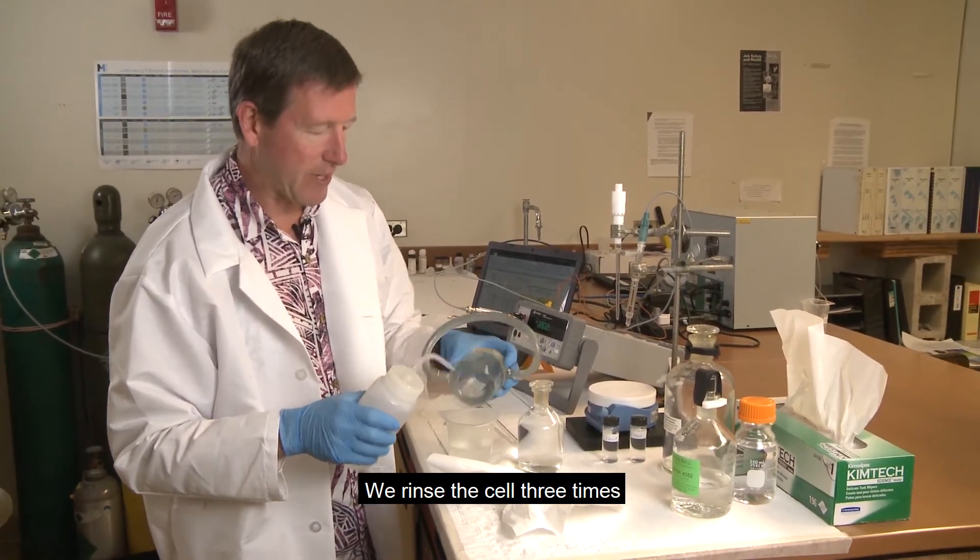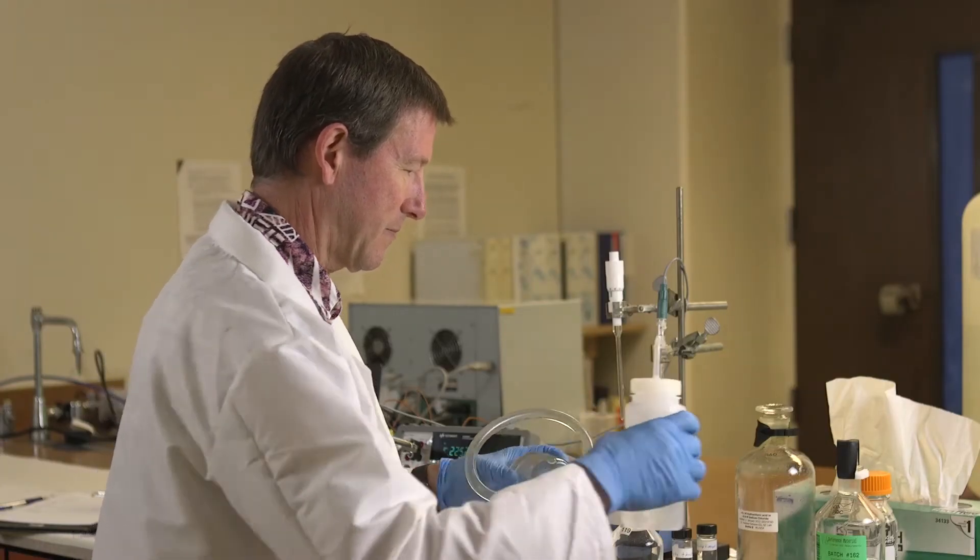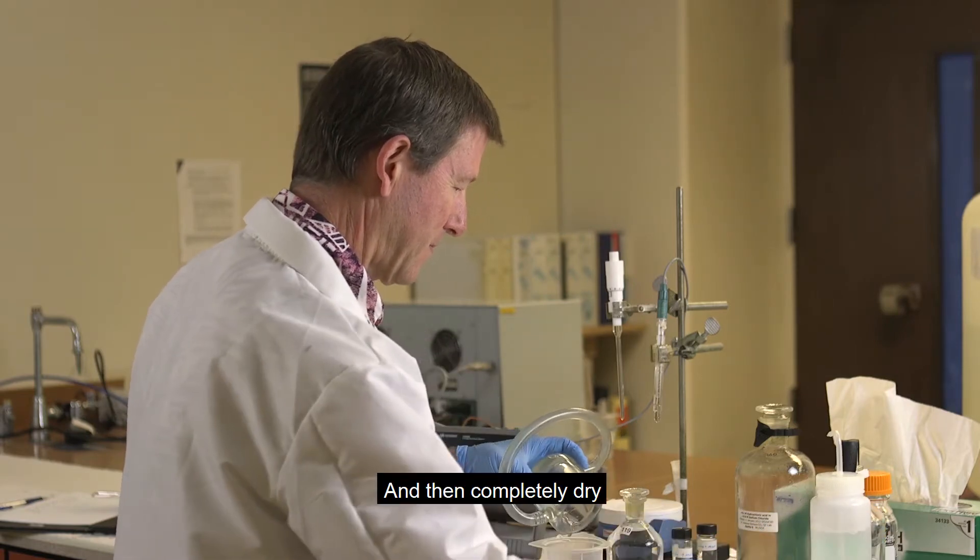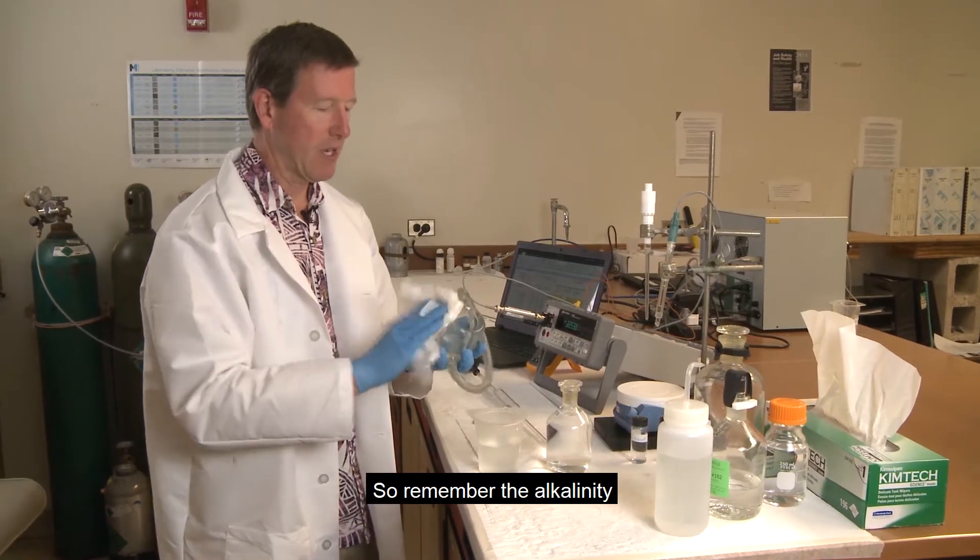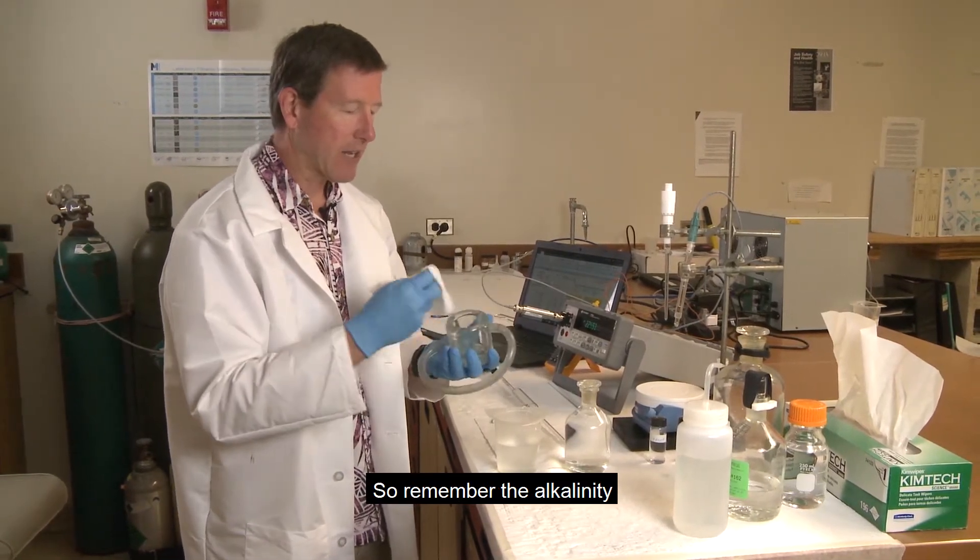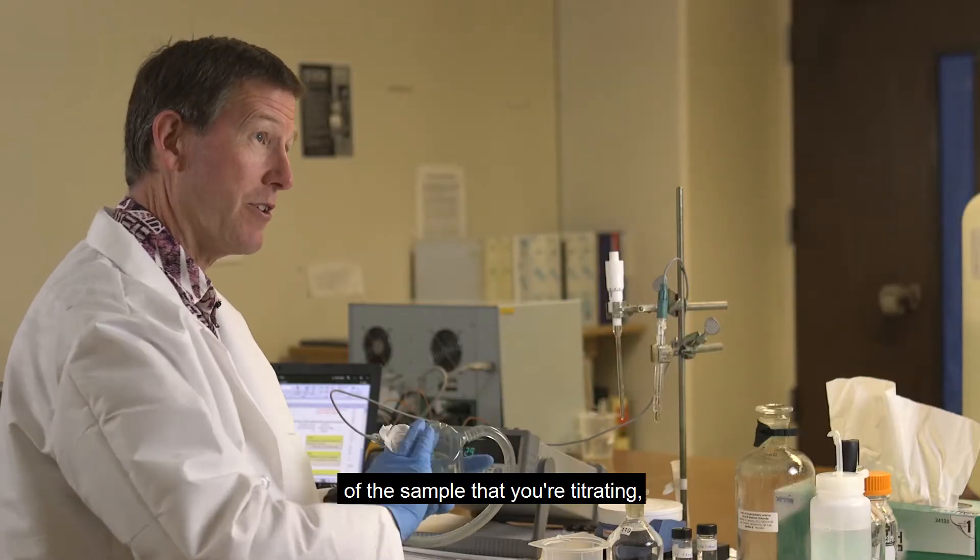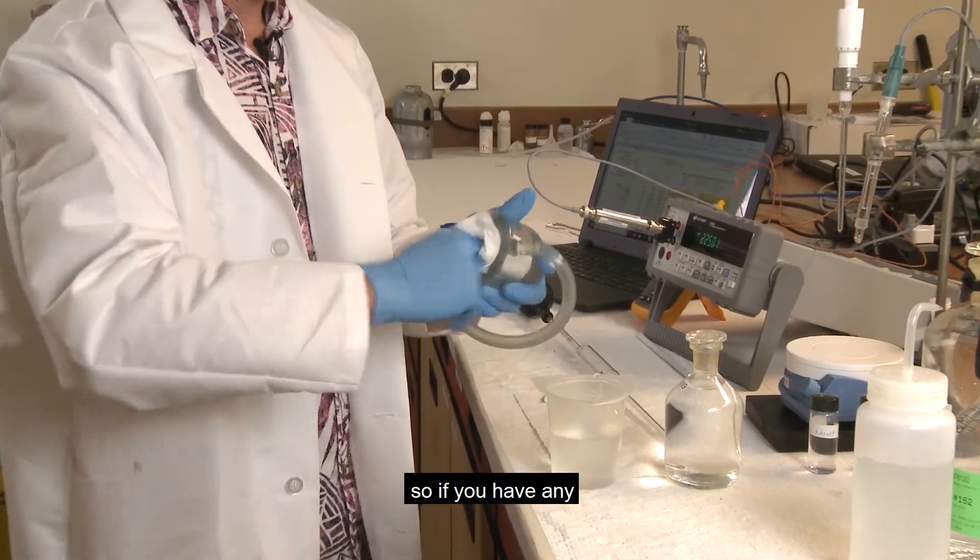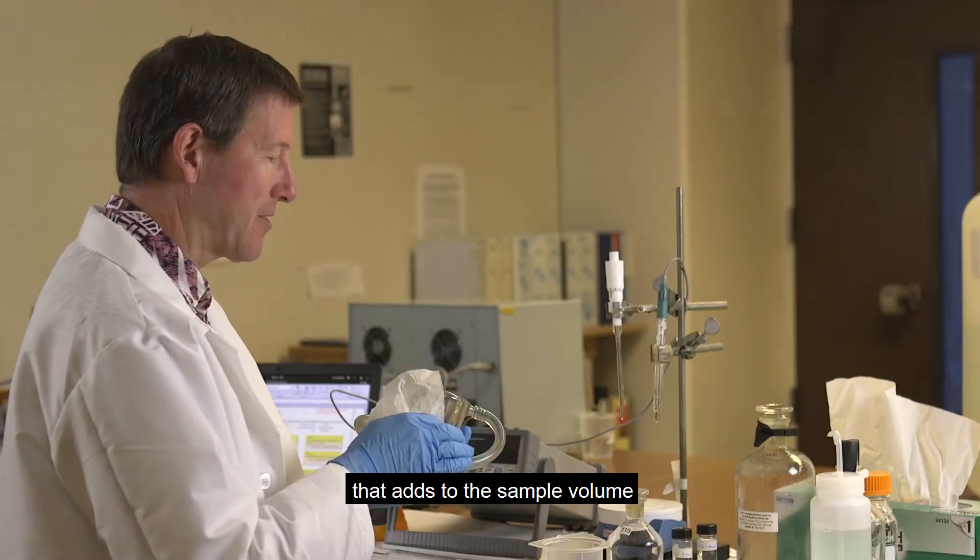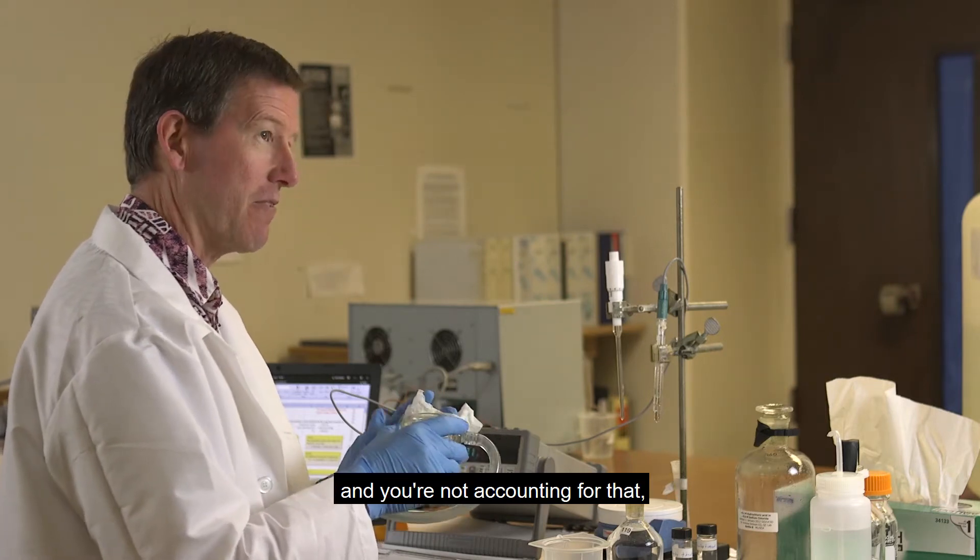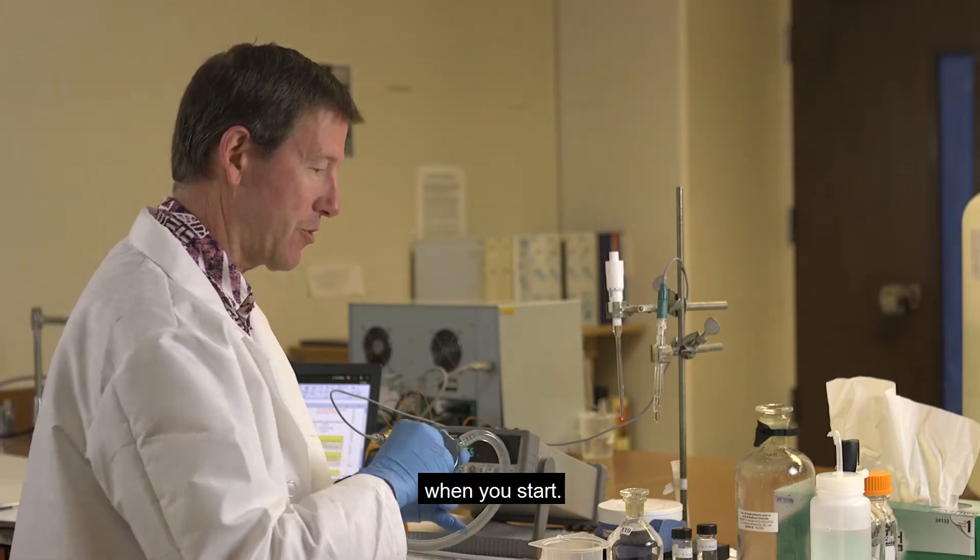We rinse the cell three times with your distilled water and then completely dry the sample, dry the container. Remember the alkalinity is a function of the volume of the sample that you're titrating. So if you have any water in the titration cell, that adds to the sample volume and you're not accounting for that. So you want the titration cell to be completely dry when you start.